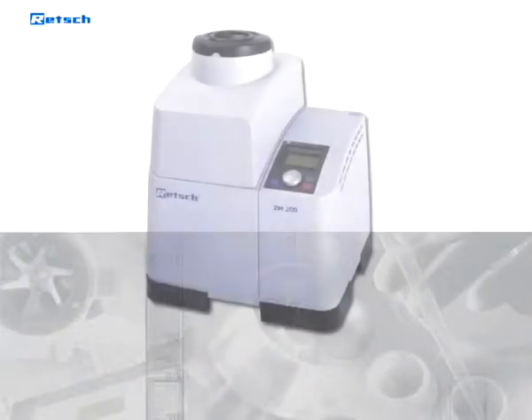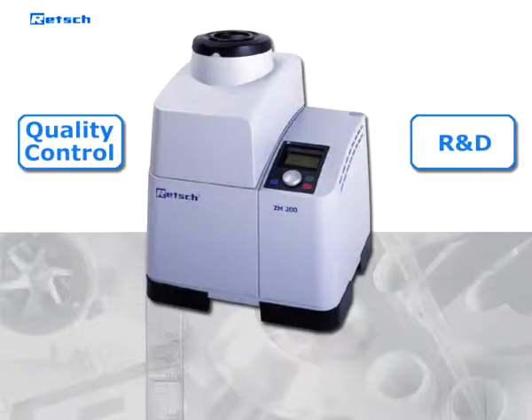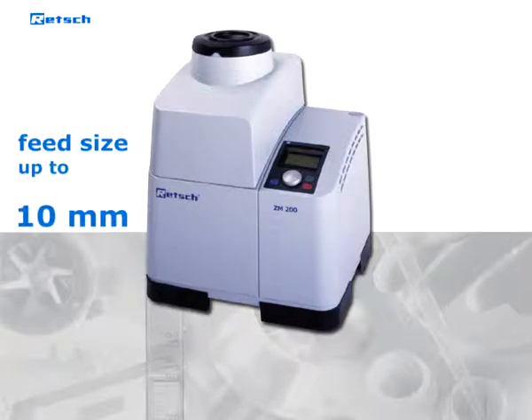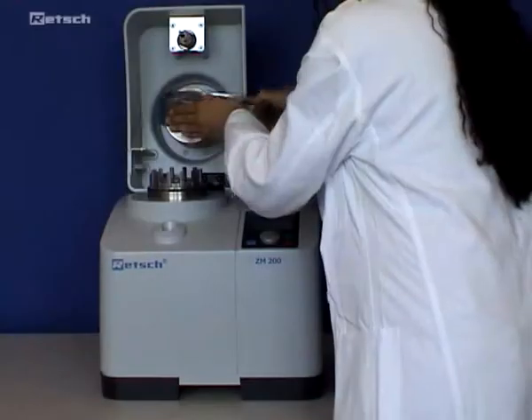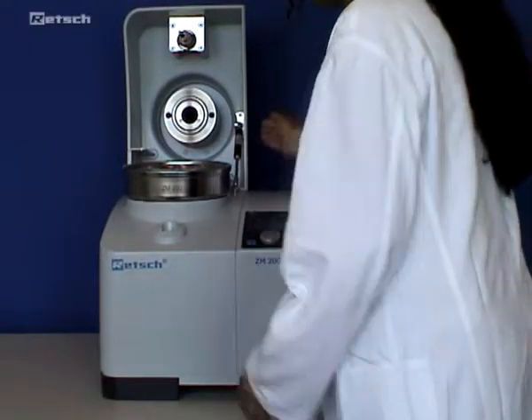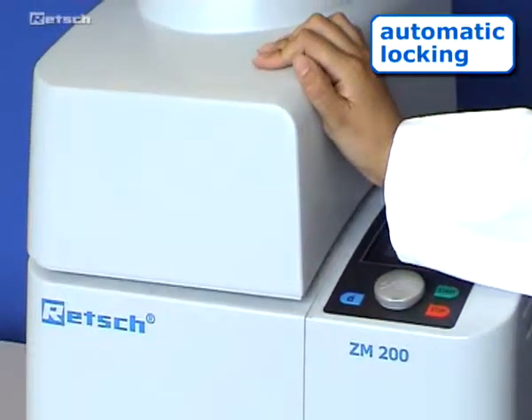The ultra-centrifugal mill can be used for both quality control as well as R&D. With a maximum feed size of up to 10 millimeters, a fineness of down to less than 40 micrometers can be achieved. After placing the cassette together with the sieve, the lid only needs to be pushed down. Locking of the lid takes place automatically.